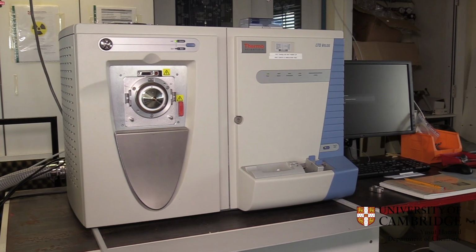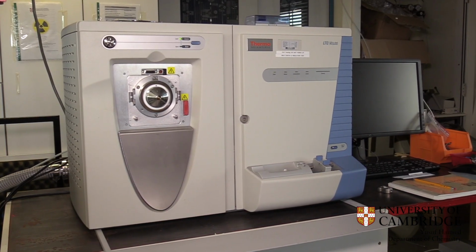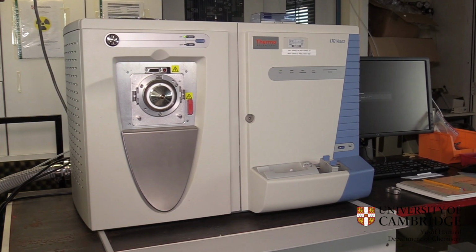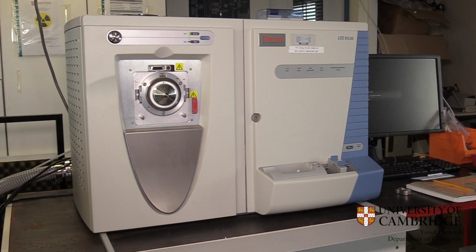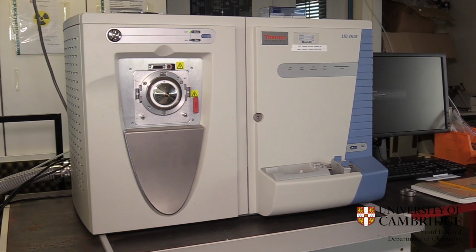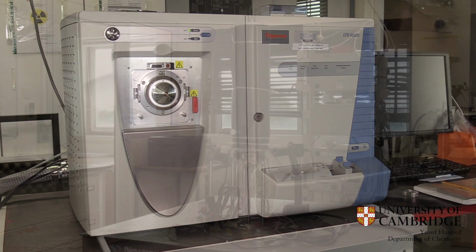We have a project in which we use microfluidics to develop new techniques to analyze organic compounds in ice cores. And this is the instrument that we use that is more widely available for the lab members working on instrumental development compared to the fancier version, the Orbitrap that you've seen before, that is mainly used for applications.